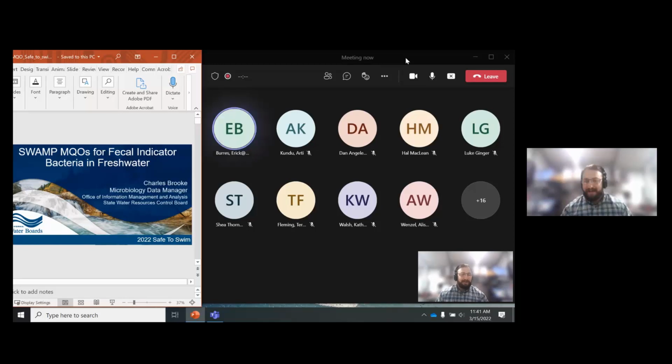Can we factor in turbidity to try to massage some of that data to get a better, more accurate number? Possibly, but to get that through the pipeline and get something validated that would incorporate that, I haven't seen anything, and I don't see anything under development. So I would be interested if someone has some ideas, because these are the methods that we have set up for SWAMP.